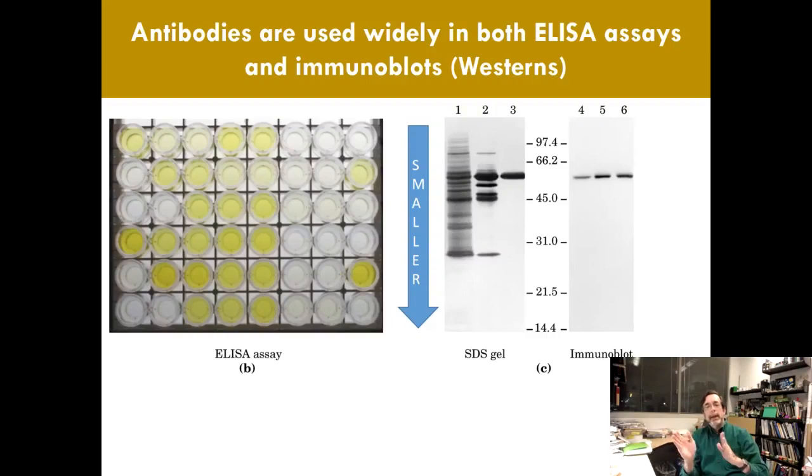Lane 2 and lane 5 go together, lane 6 and lane 3 go together, and you can see that, if anything, the antibody binding in lanes 4, 5, and 6 is increasing as you move from lane 4 to lane 6. That means if your process is moving in that direction, that you are getting more and more pure protein as you do it. We're not going to do this, it's not a lab class, but you might see data like this sometimes, and you need to know that ELISA data means you have an antibody recognizing an antigen, and it's shown by color, either the color of a well or a color of a band in a blot at the exact location where that thing has been located.